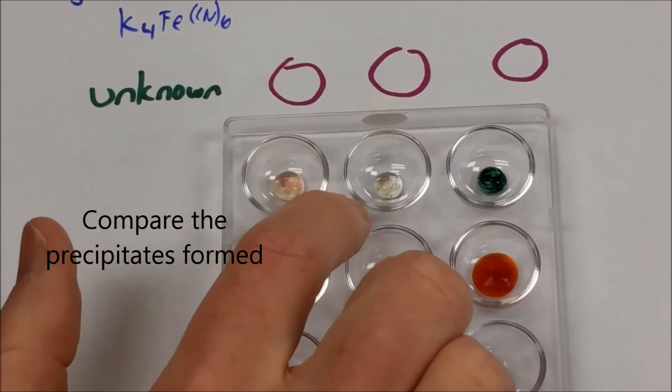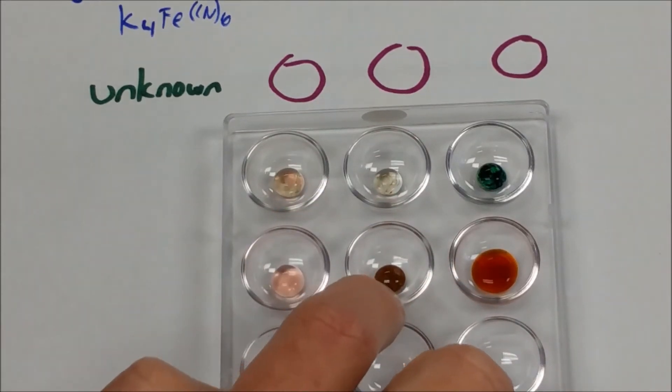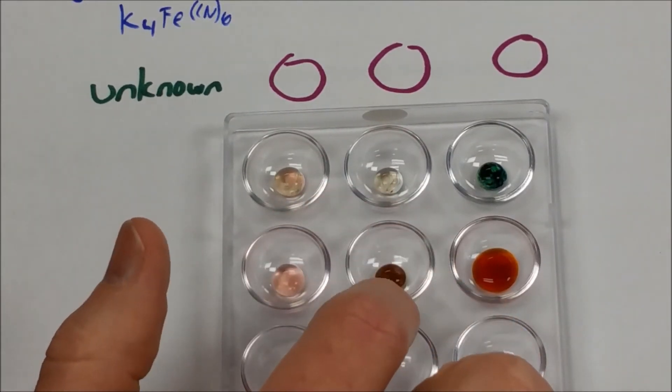And then here we're looking at what the standard ferrocyanide did with copper, and here we're looking at what our unknown did. And are they the same or are they different?